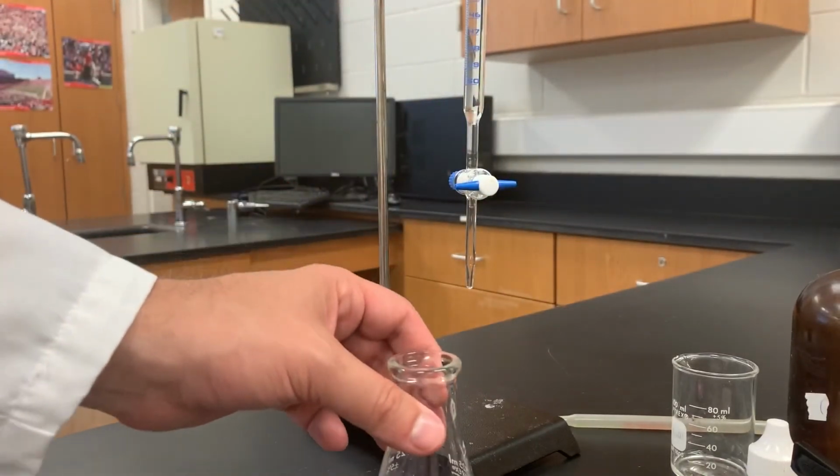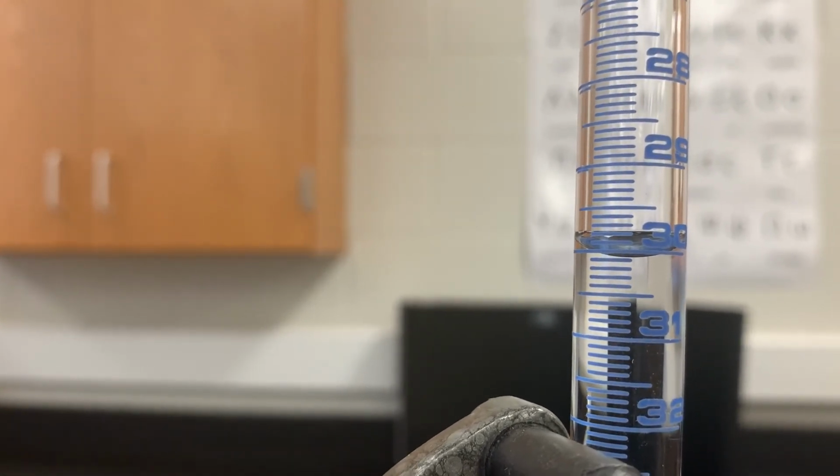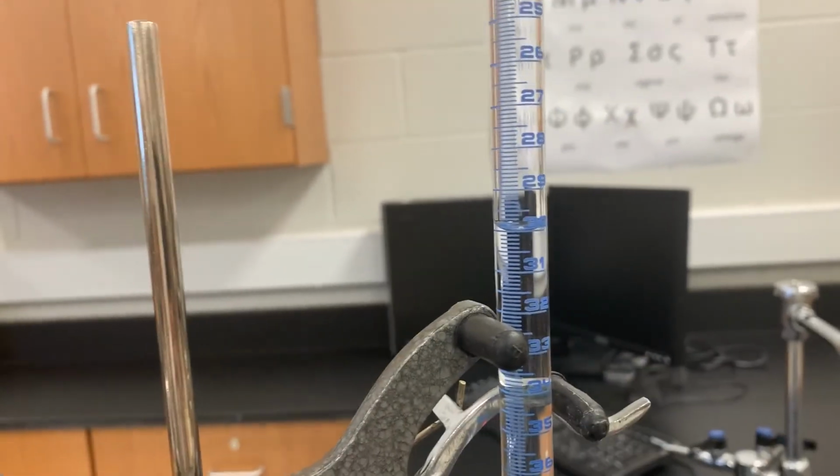And so now we come over to the burette and we read it. And it looks like this burette is sitting right at 30.1 roughly milliliters right there. So now we have enough information that we can calculate the molarity of the acid.